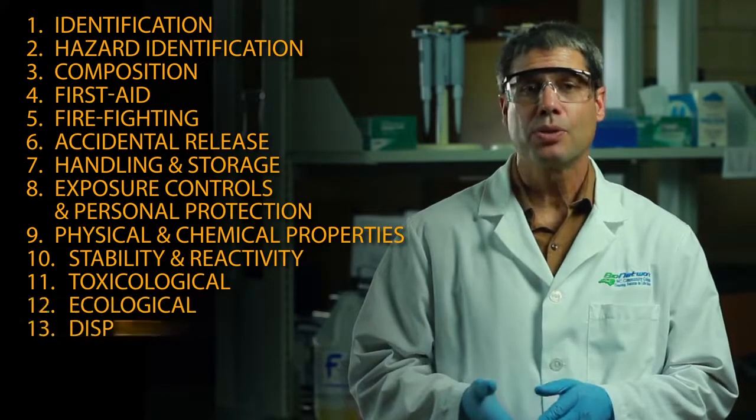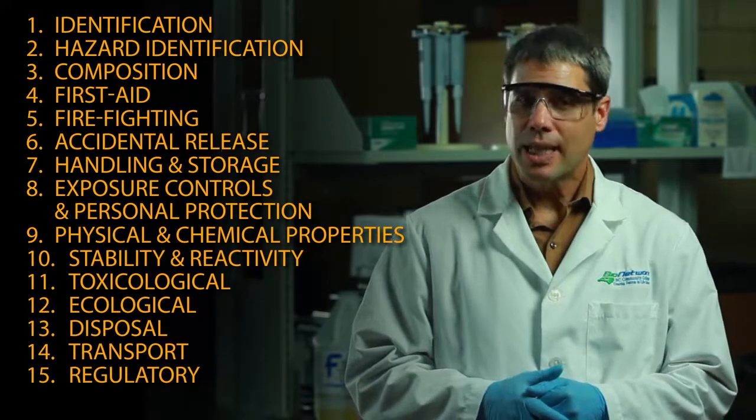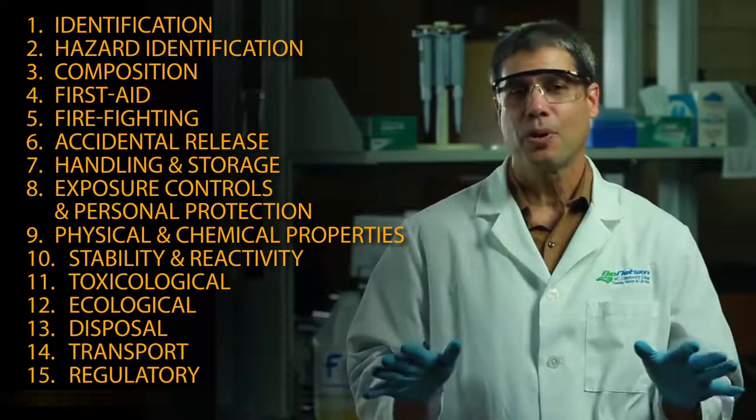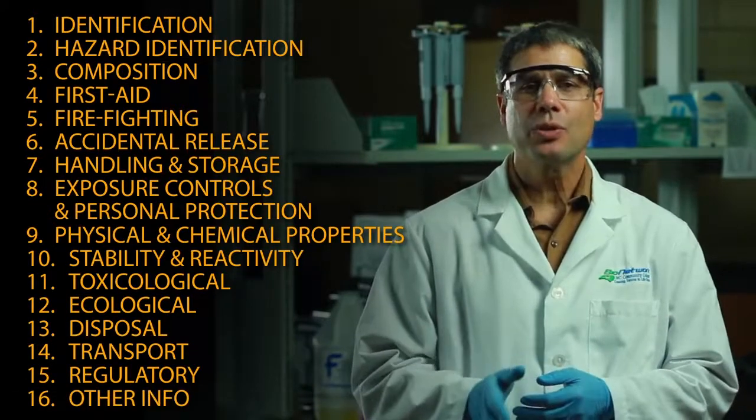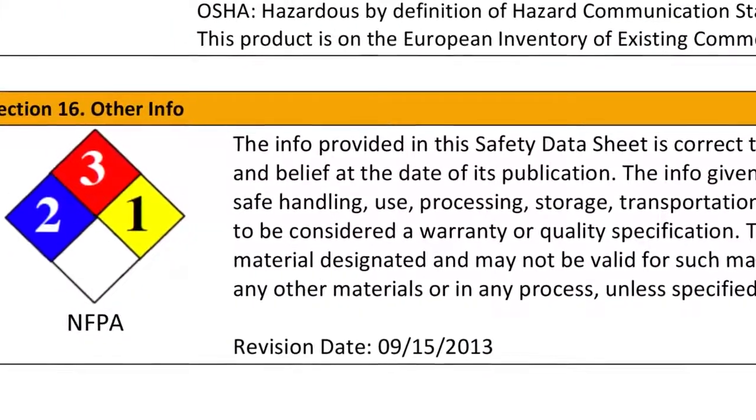Ecological, disposal, transport, and regulatory considerations. Section 16 is for any other pertinent information. This is where you'll find the date that the SDS was prepared along with the last known revision. Safety data sheets provide a lot of information about how to use chemicals safely in the lab.